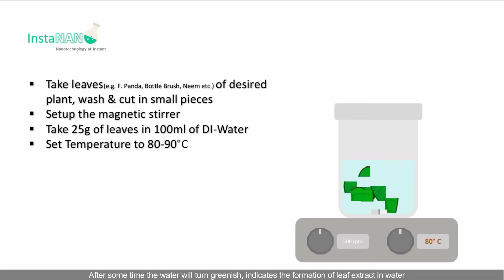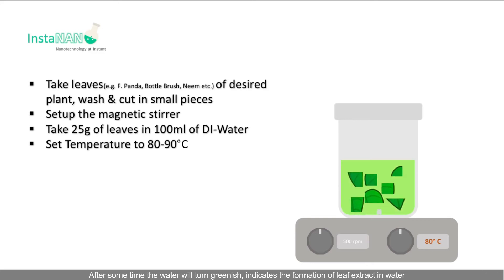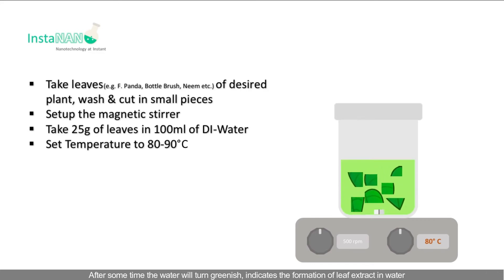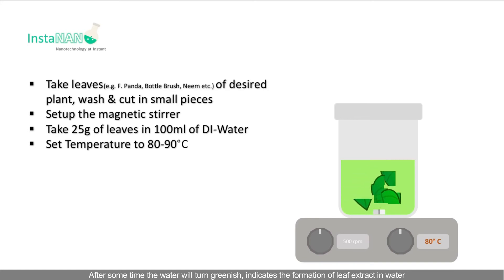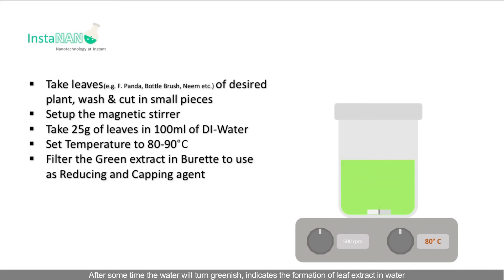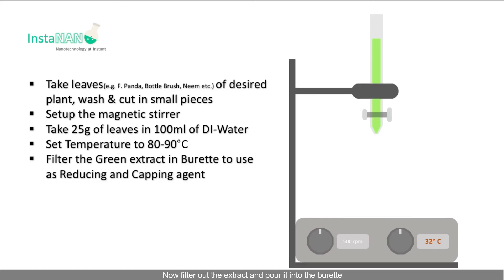After some time the water will turn greenish, indicating the formation of leaf extract in water. Now filter out the extract and pour it into the burette. This extract will be used as a reducing and capping agent for nanoparticle synthesis.